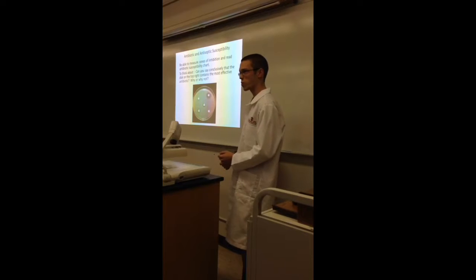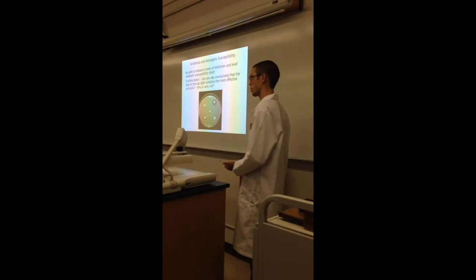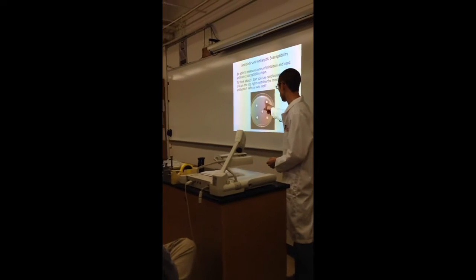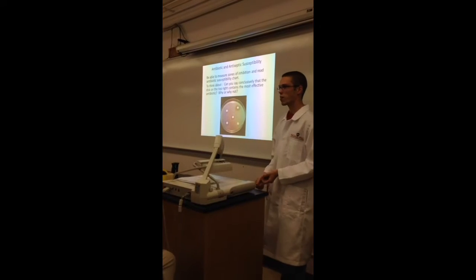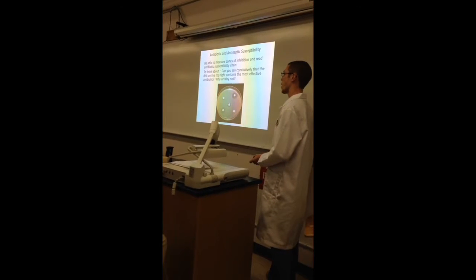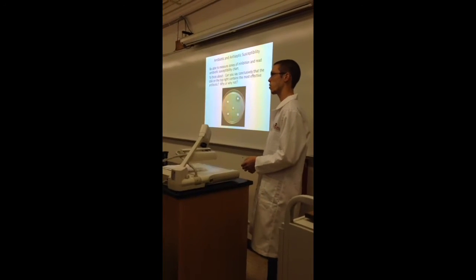So what information was on the back of the discs? The name of the antibiotic, concentration. So that's what we were looking for here. For example, if this is like norfloxacin or something that's a DNA inhibitor, it takes a very, very small amount of that antibiotic to cause a large clearing. Whereas if you added the same amount of something like penicillin that a lot of bacteria are becoming resistant to, you would expect a much smaller zone of inhibition.